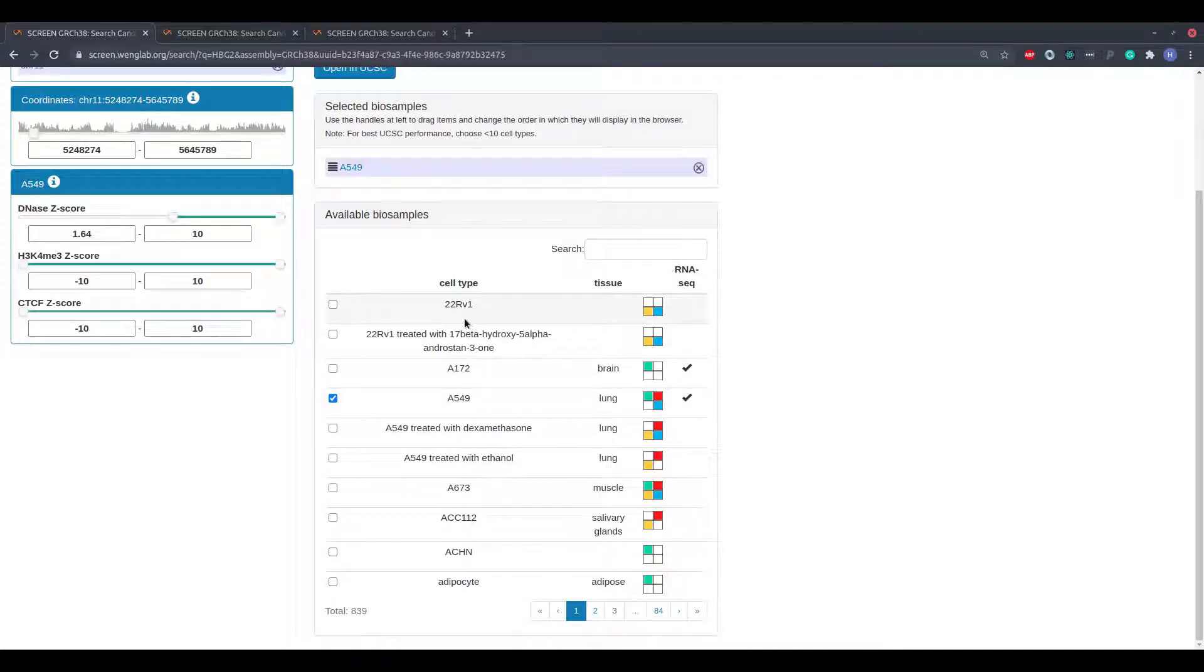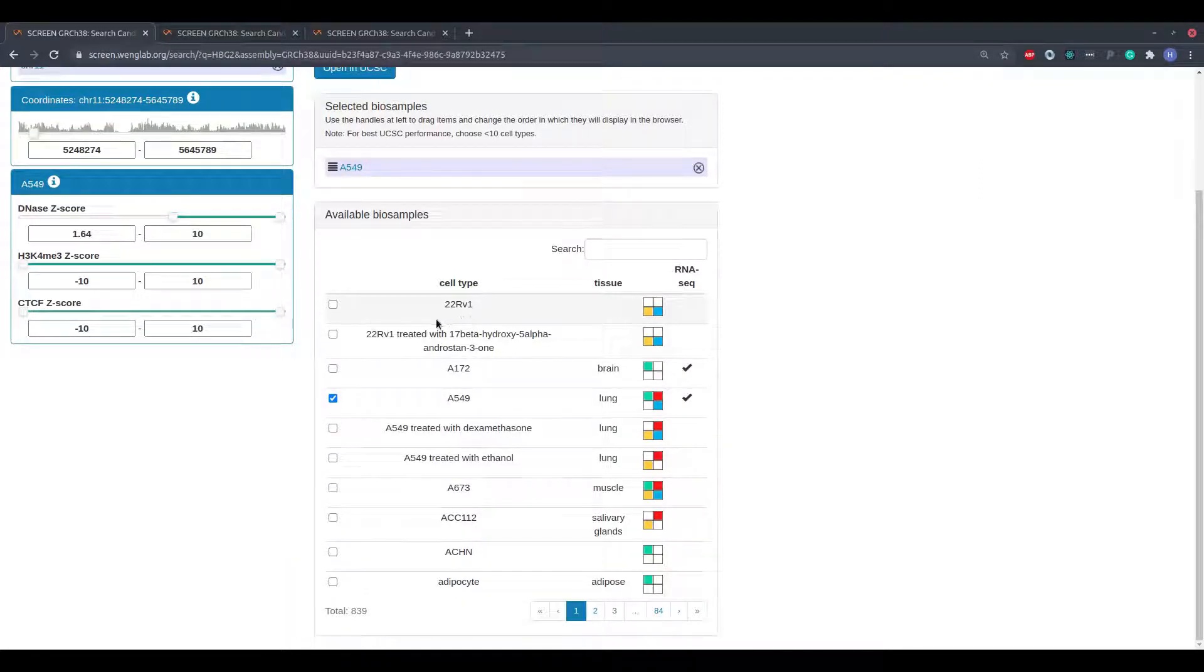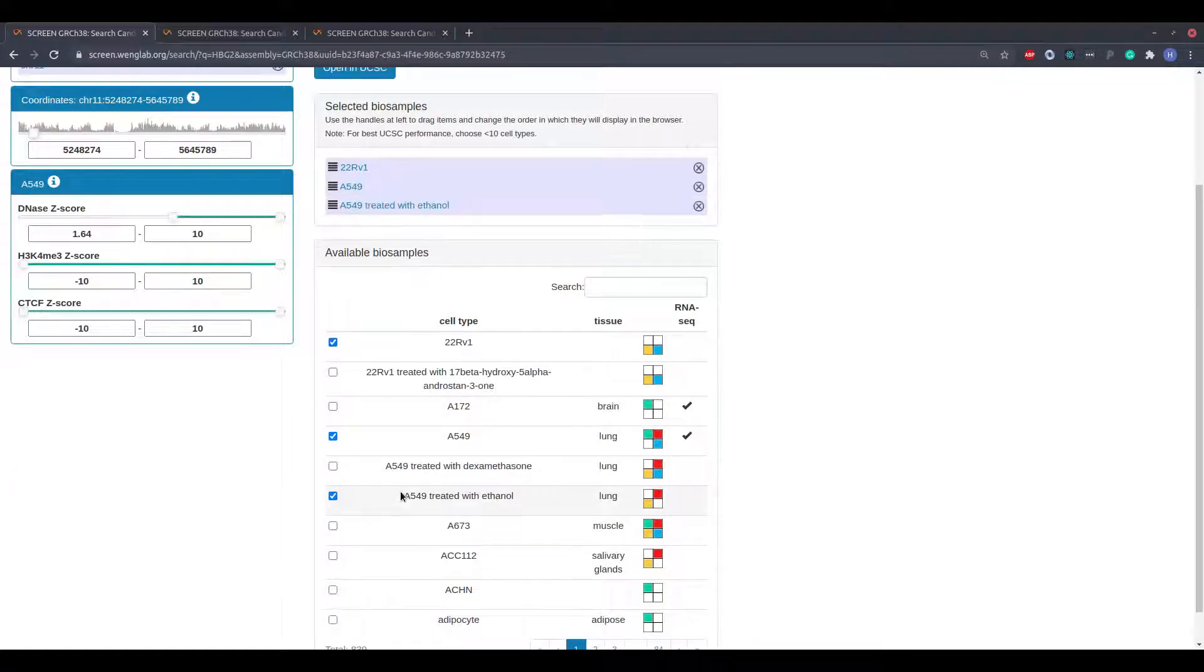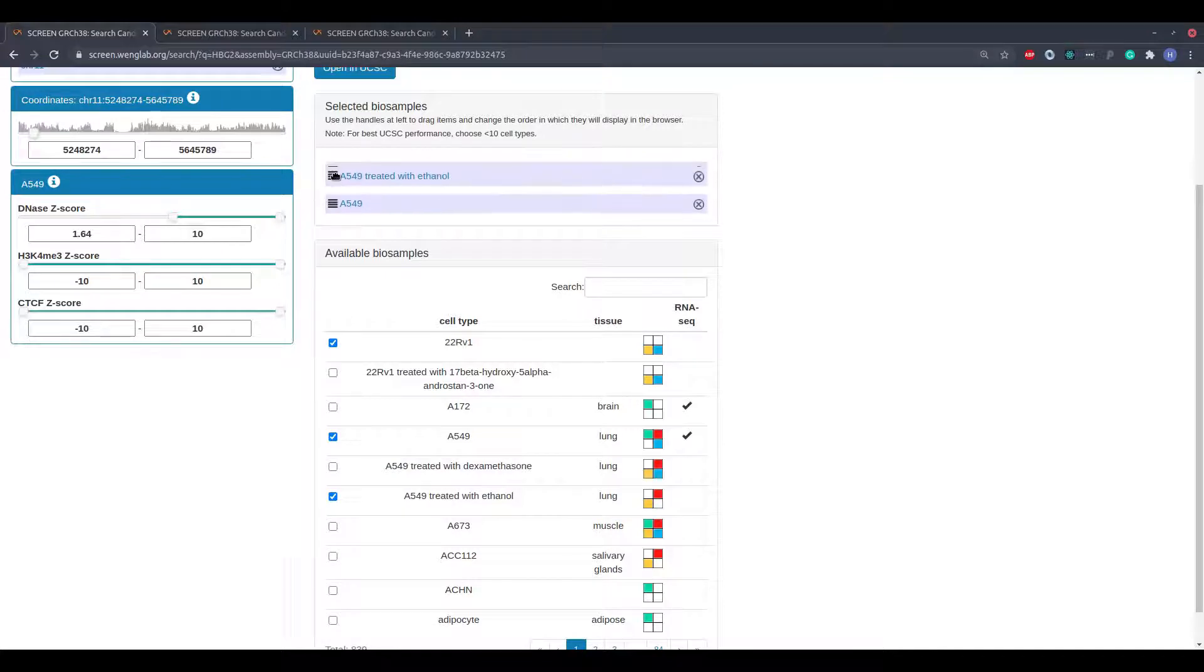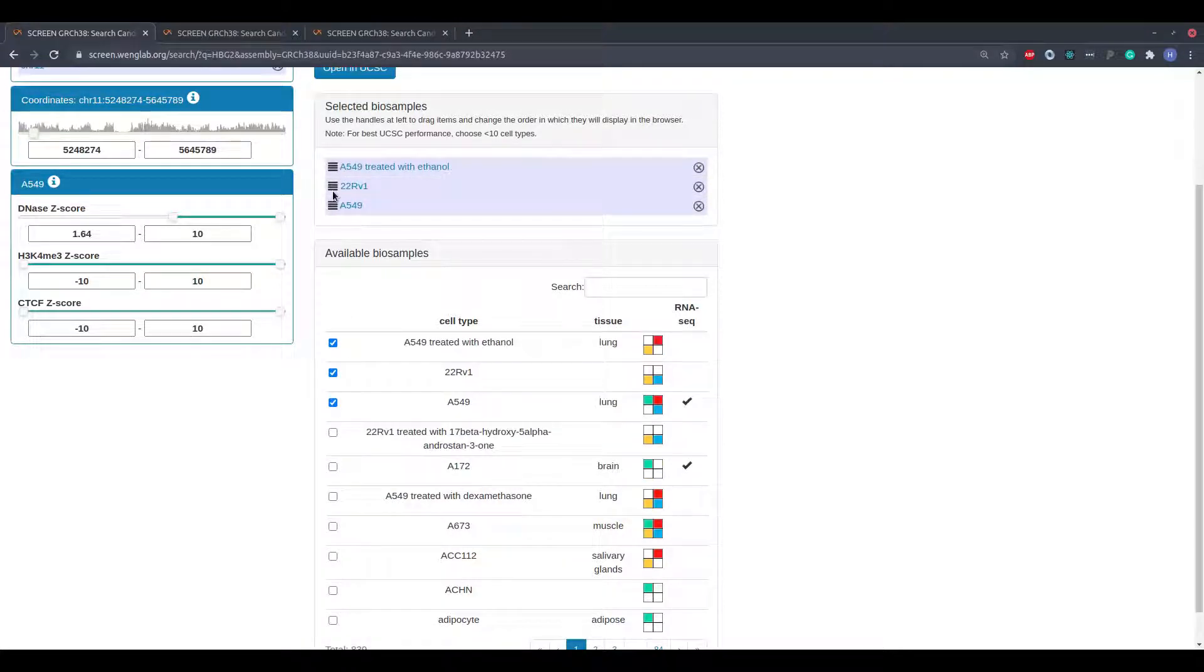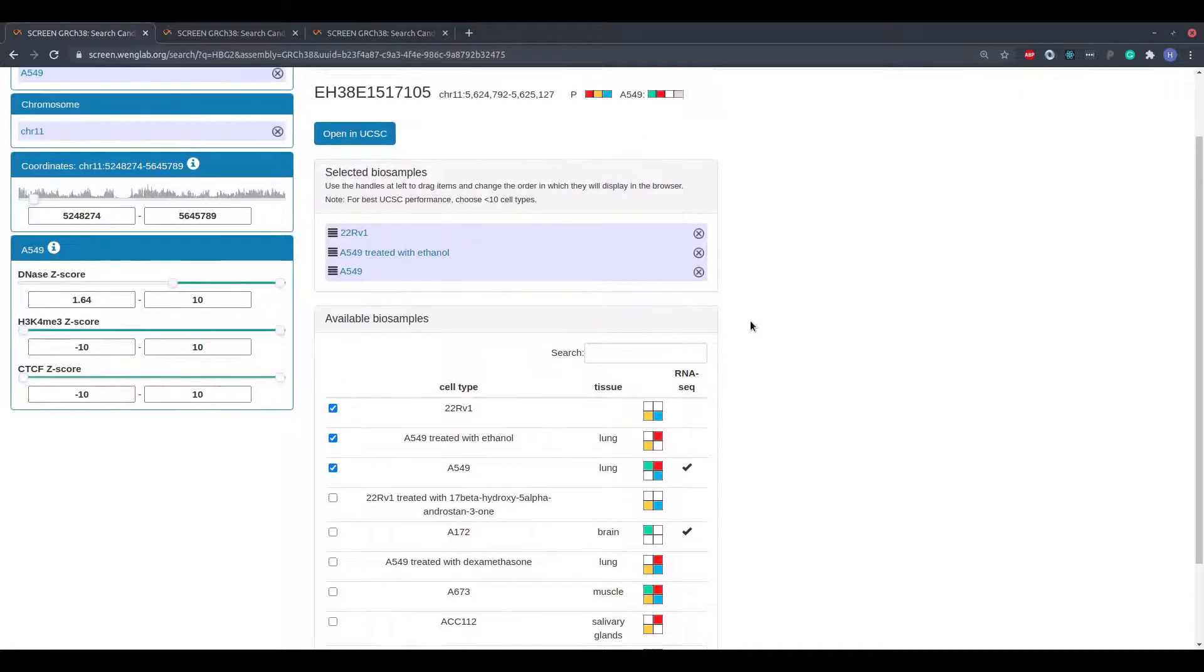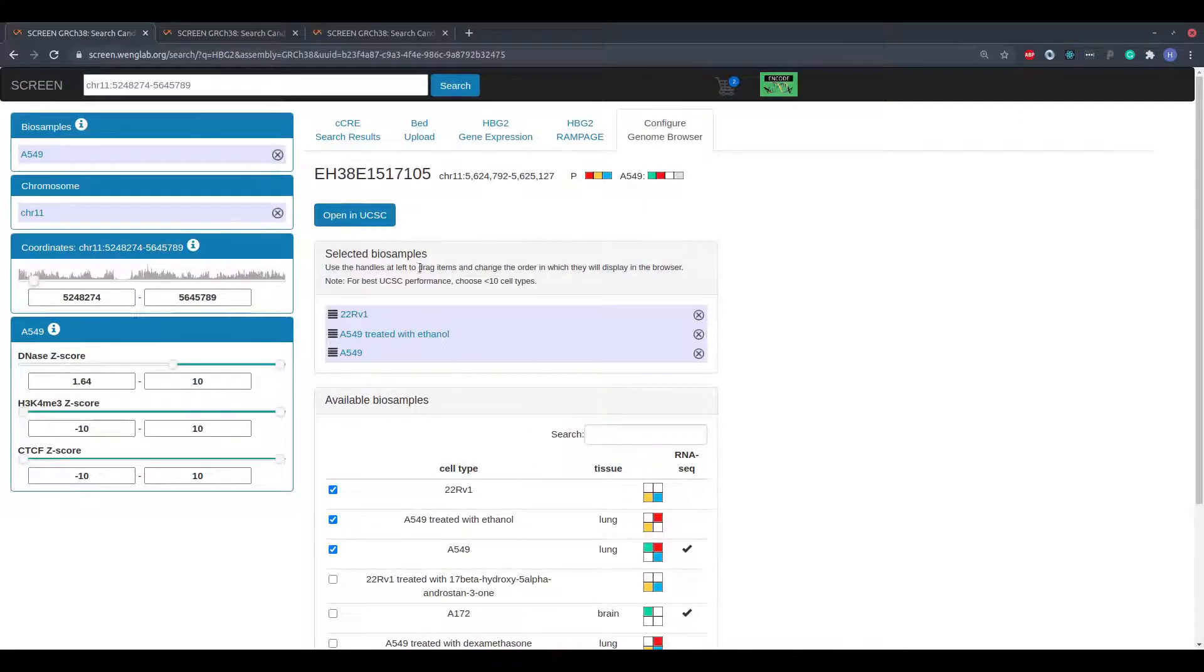To select a cell type for visualization, I simply click its row within the available BioSamples table. The rows in the selected BioSamples view may be dragged and dropped using the handles at the left. This will change the order in which the cell types will appear in the genome browser. When I am ready to visualize the data, I simply click the Open in UCSC button.